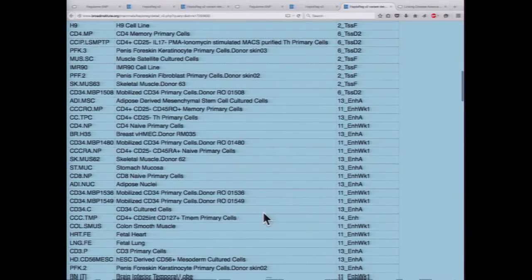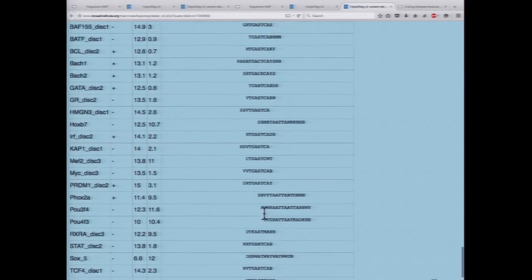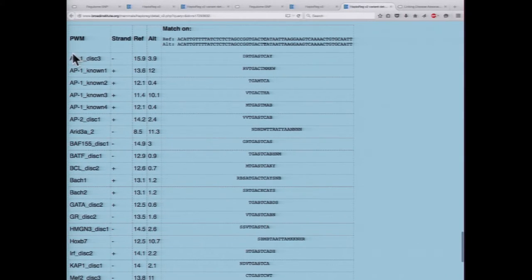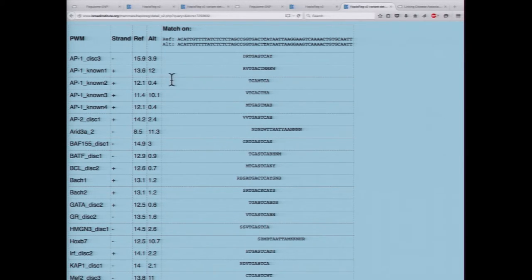If we also scroll down to the motifs and look at the AP1 motif, in many cases there's actually a drastic change in the log odds going from the reference to the alternative allele. So it's possible that this variant is actually disrupting transcription factor binding of AP1 — and AP1 includes Jun, which we saw was bound from ENCODE data. So it could be drastically affecting the binding of this transcription factor and then possibly leading to dysregulation of SMAD3.